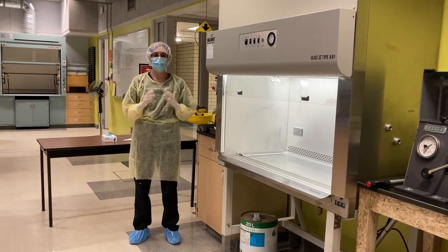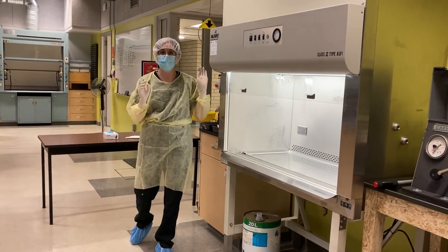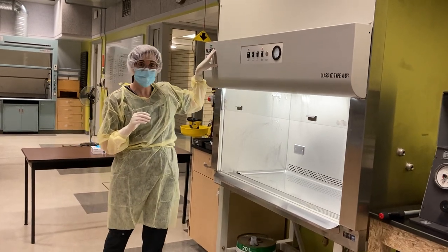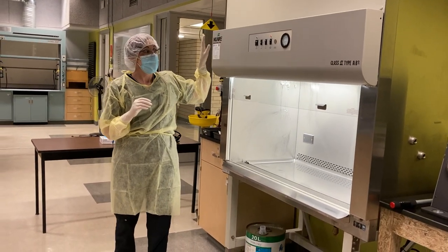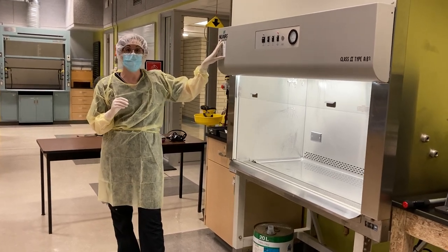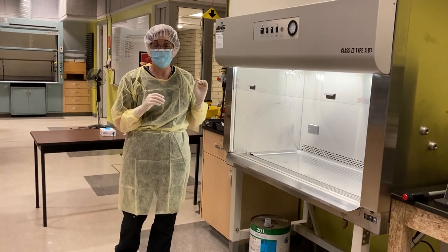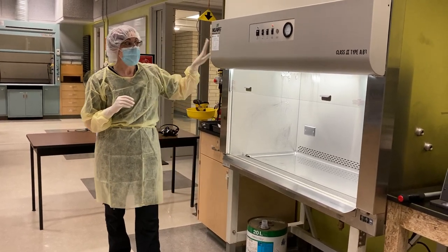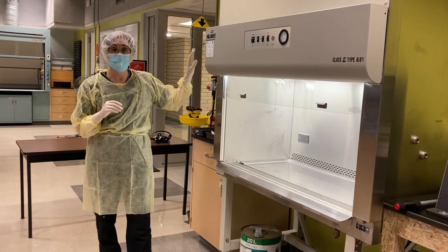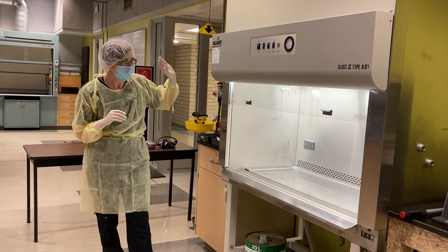Now that we've fully garbed and completed our hand hygiene, we're now gonna clean our primary engineering control. Now this one here is a biological safety cabinet. Other forms of primary engineering controls are your horizontal laminar airflow hood, as well as your vertical laminar airflow hood. A biological safety cabinet is cleaned the same way as you would clean a vertical laminar airflow hood.